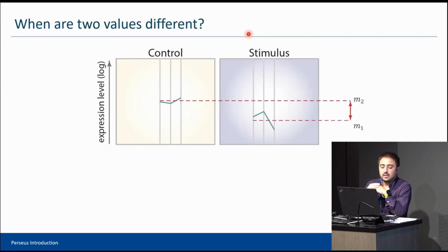Okay, so exactly. Let's say you have an expression proteomics experiment, and you want to get a set of differentially expressed proteins in your experiment. So for this, you will have a control and a stimulus. So let's say healthy and sick patients, and you want to see exactly which proteins are the biomarkers here. The question that you really want to ask is, which protein is really changing after applying some stimulus, okay?